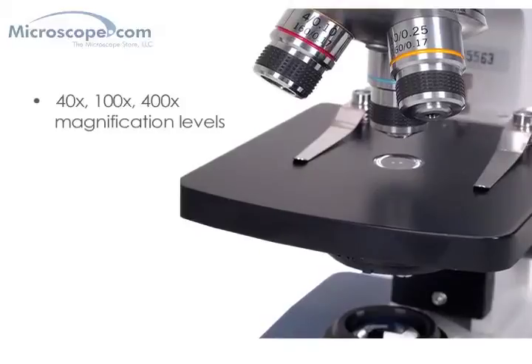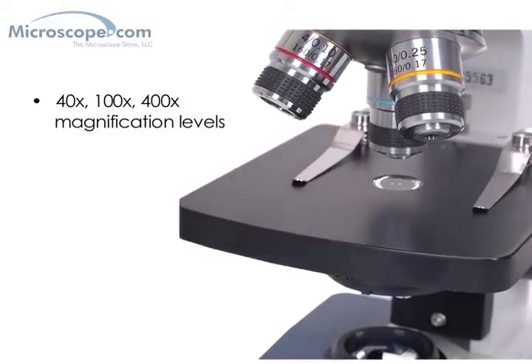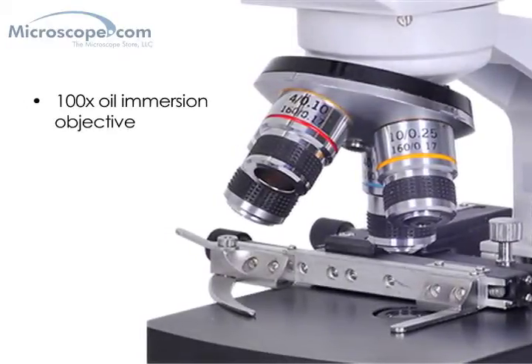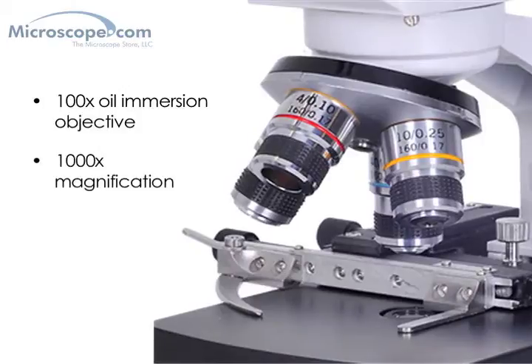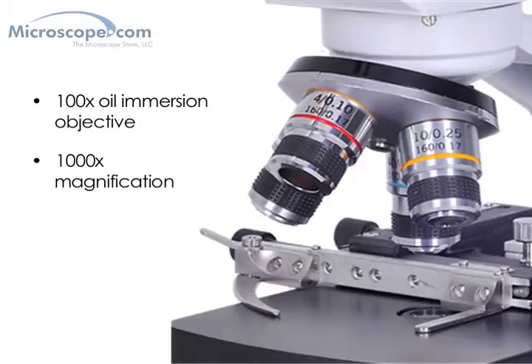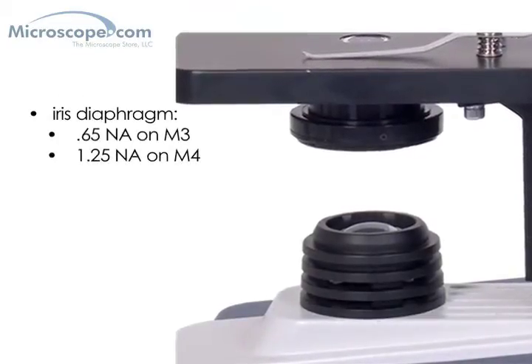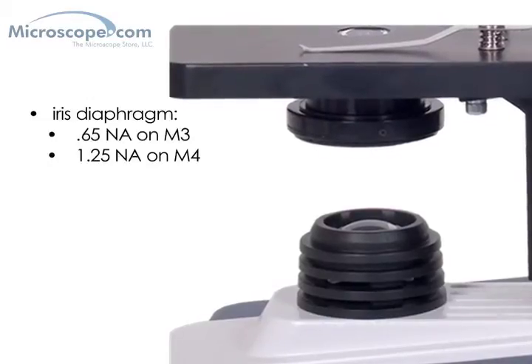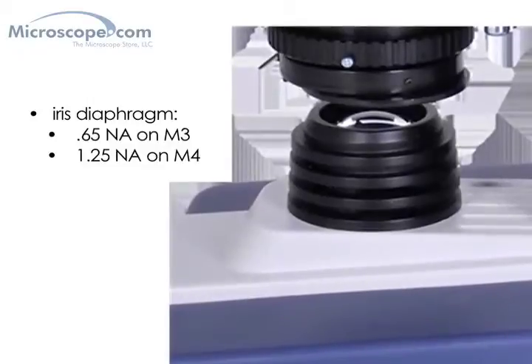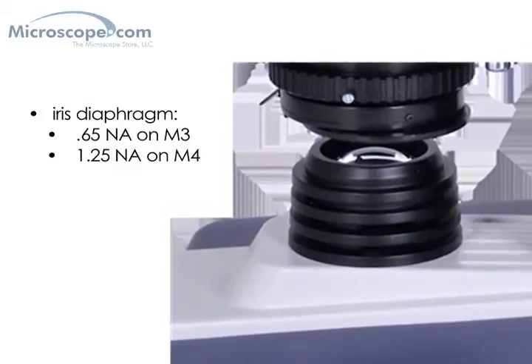The three objectives on the M3 model provide 40x, 100x, and 400x magnifications. The M4 model adds an additional 100x oil immersion objective, which gives that model a full 1000x magnification — the full range that you would typically see on any professional biological microscope in a lab setting. Both microscopes include professional condensers with iris diaphragms: a basic 0.65 NA type on the M3 and a full 1.25 NA on the M4. The slide holder featured on the M4 can also be added to the M3 as an option.